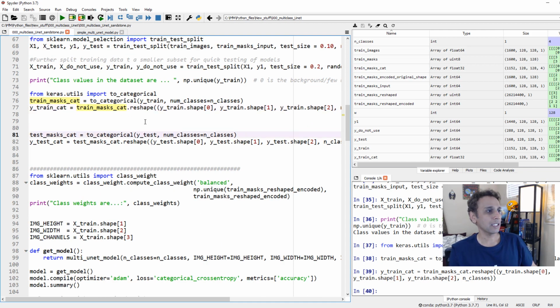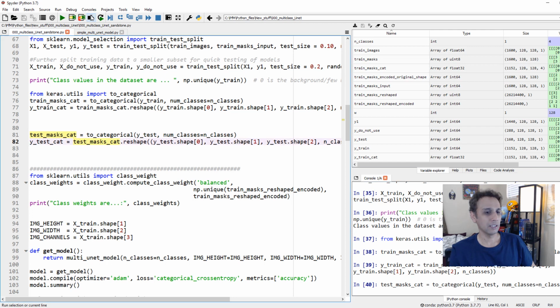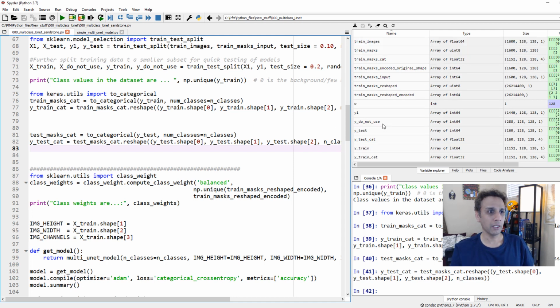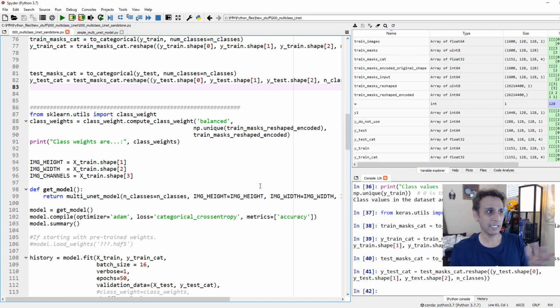Now let's do exactly the same thing for test. Okay, and then testing. Okay, so where are we? Let's again one more time confirm that everything is okay. So we have our Y test categorical, Y train categorical. Y test, we have 160 of these, 128 by 128 by 4. So you're all good now. That's it. Now you're all set.